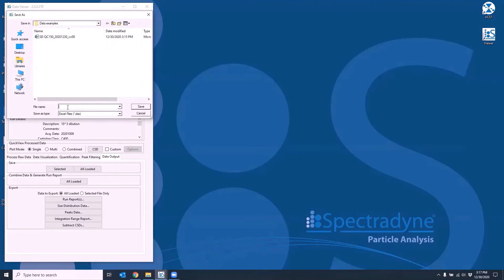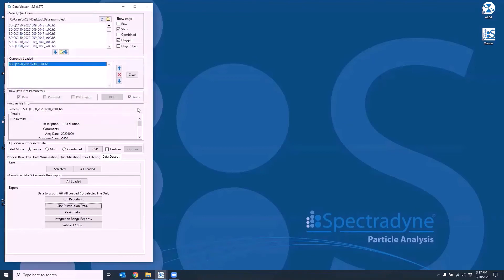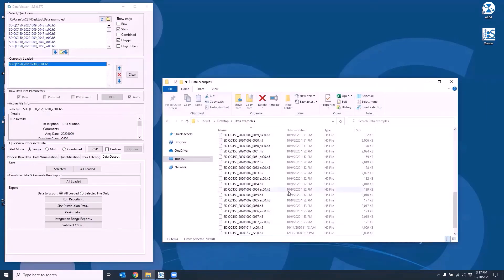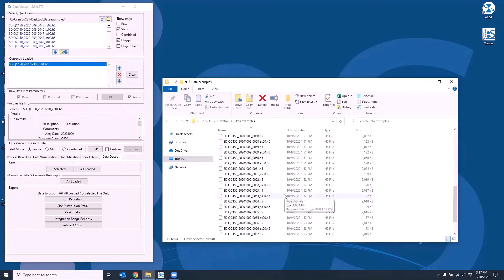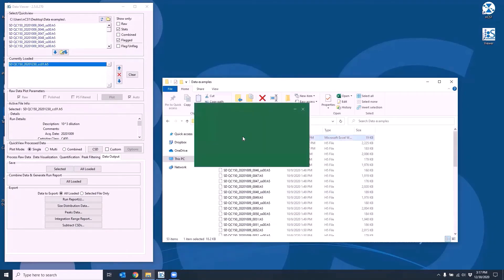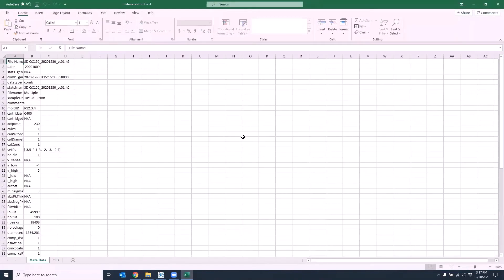If you choose to export the size distribution to an Excel file, the output file will contain two sheets. The first sheet is the metadata, which contains information about the run, and the second sheet is the CSD, which contains the size breakdown and also a custom plot of the size distribution.